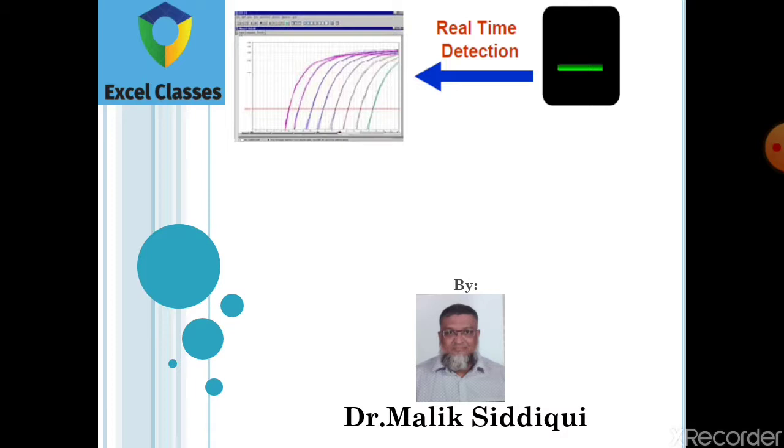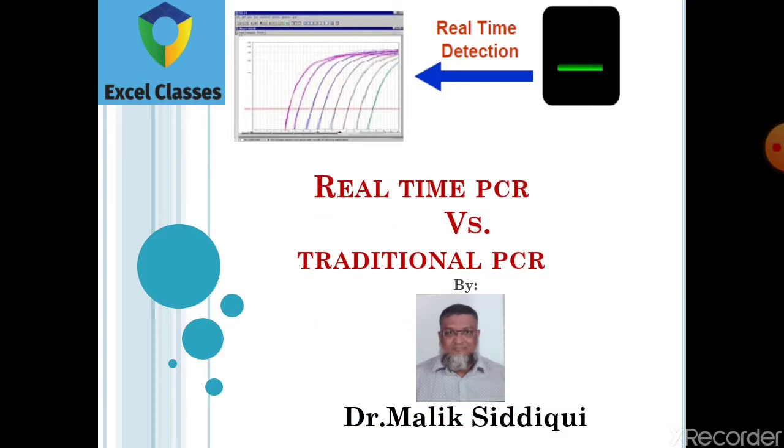So, real-time PCR is today's topic. In today's lecture, we will try to discuss the limitations of what we call the traditional PCR or endpoint detection, and the real-time PCR. So, my topic today will be real-time PCR versus traditional PCR.